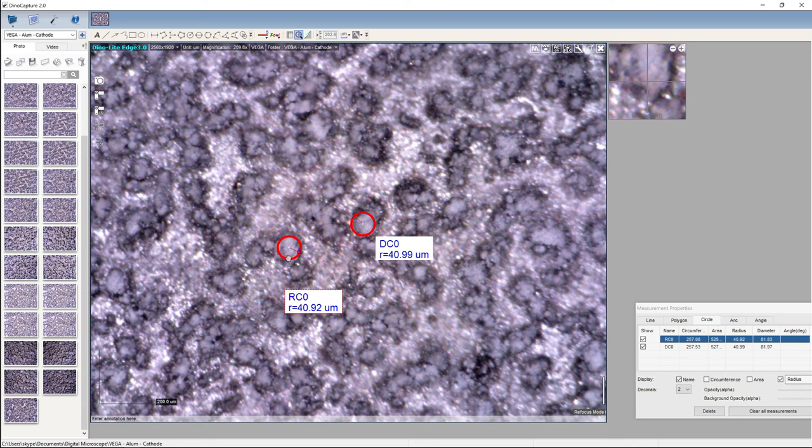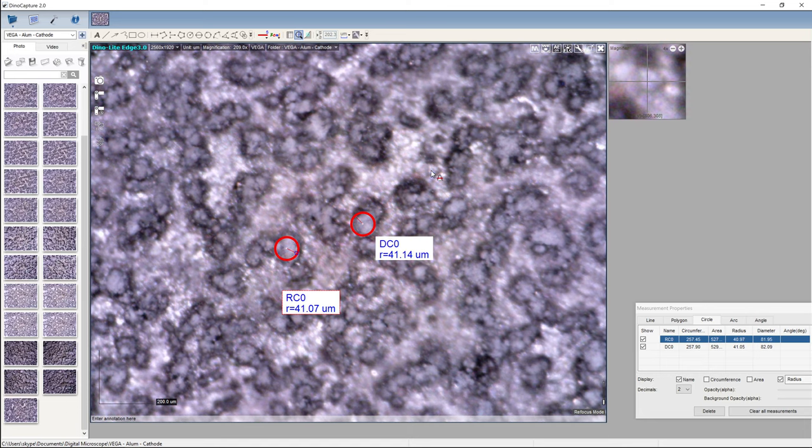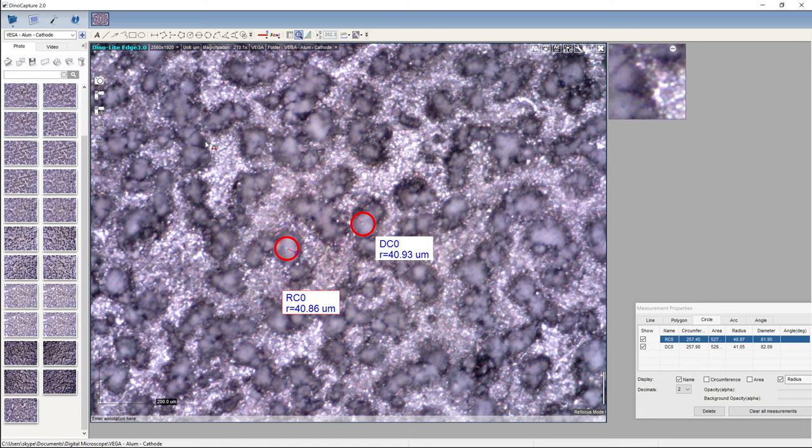Now this might be to do with the distance between the anode and the cathode. I wouldn't be surprised if that's the case because, as we've already identified, further away from the center they change their size. So, the channel sizes. Is that a hexagon there? Is that a bit in the center? I don't know. Are these explosions that occur on the aluminium and these are the detritus that gets thrown out to the side? Is that what's going on?